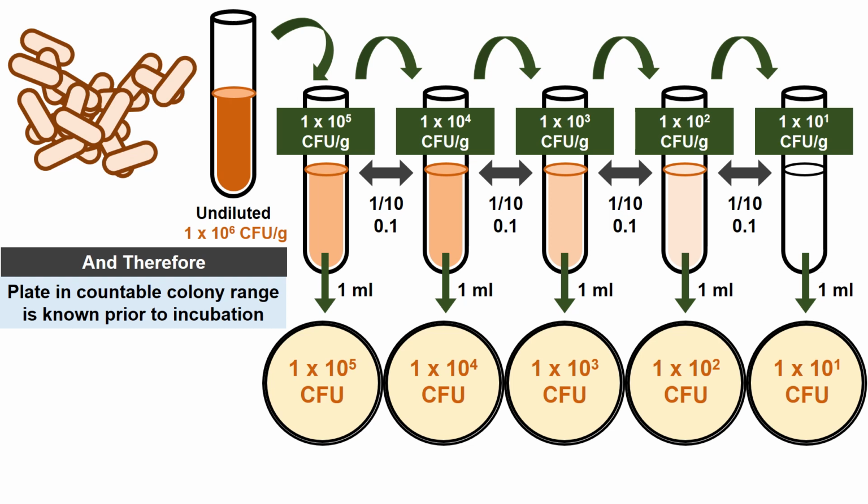Goldilocks, you know what I'm talking about? All right. The only one you want is 100. And that came from the 1, 2, 3, 4th dilution tube. 100 CFUs. Outstanding.